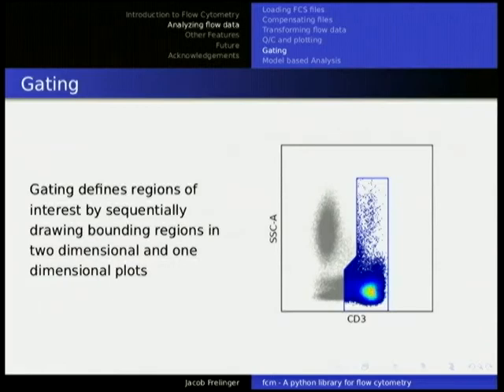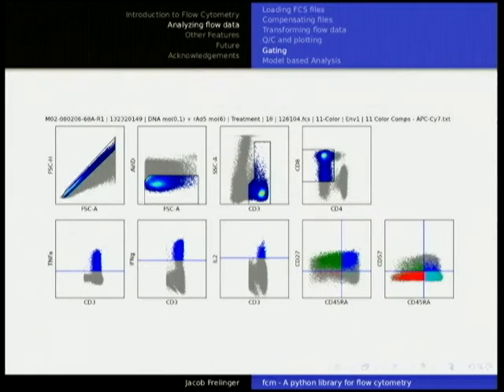So traditional analysis, once you have your data loaded, is to identify specific cellular populations. And that's typically done by gating, which is drawing some form of boundary in which you then take cells within the boundary and then typically perform another projection in a different set of parameters to slowly gate down to your purified population. So as we said before, this is grabbing out all the CD3 T cells, since CD3 is the T cell marker. And so you do it iteratively, and this is a typical analysis we did to find activated CD8 T cells.